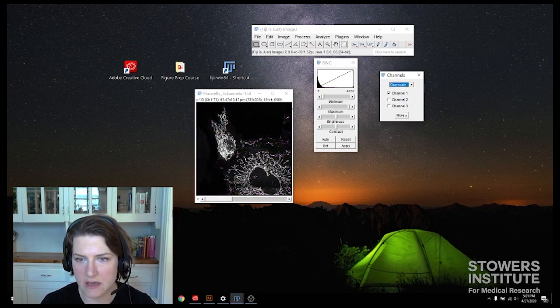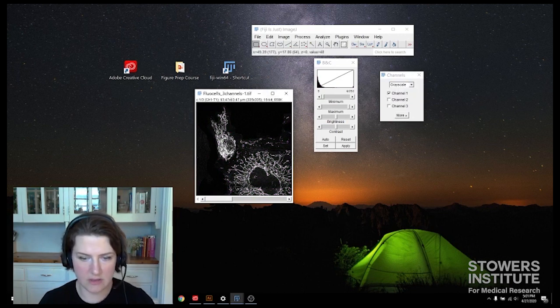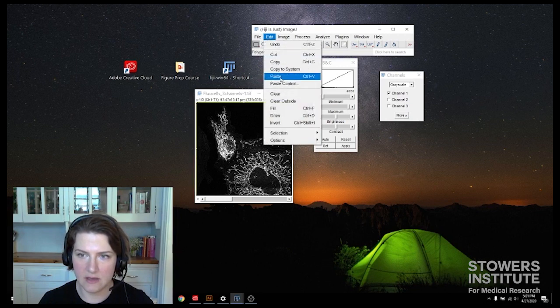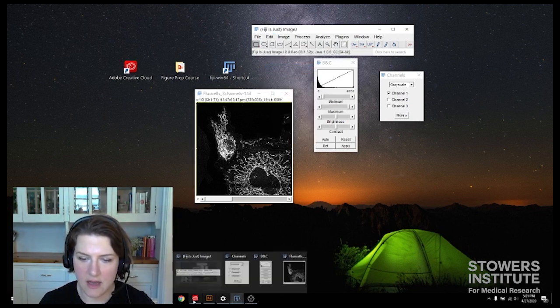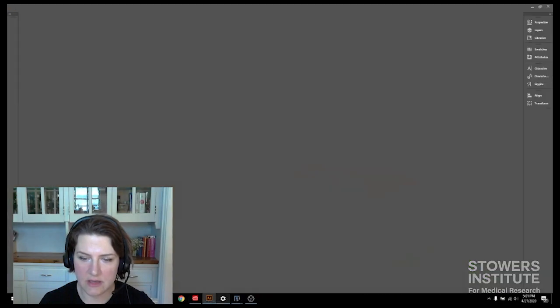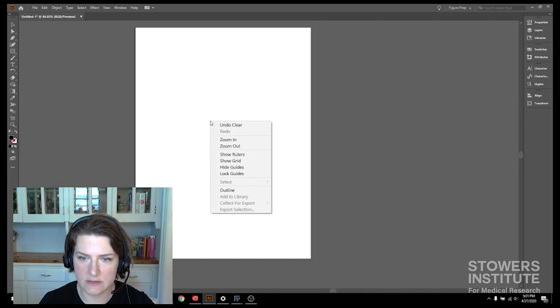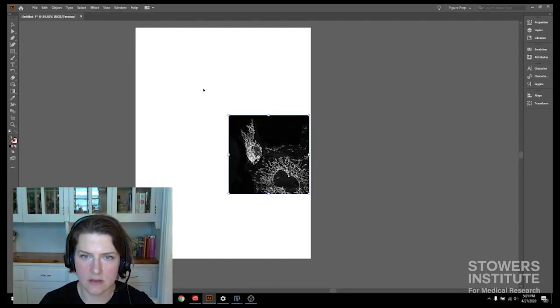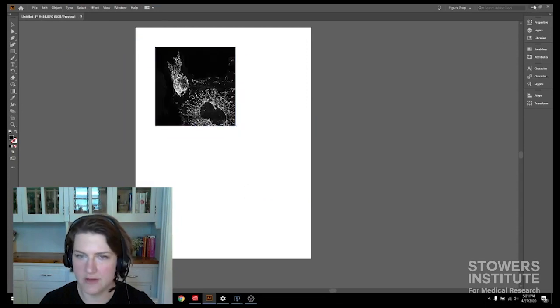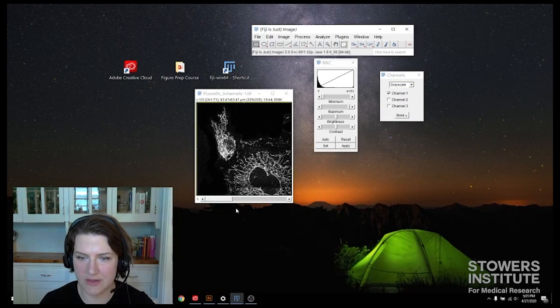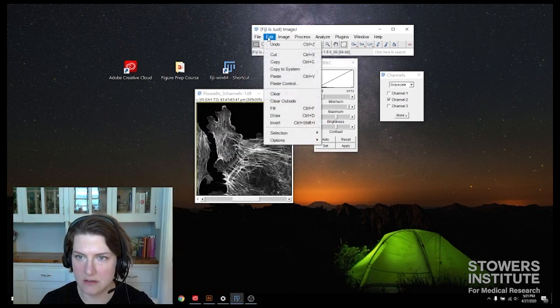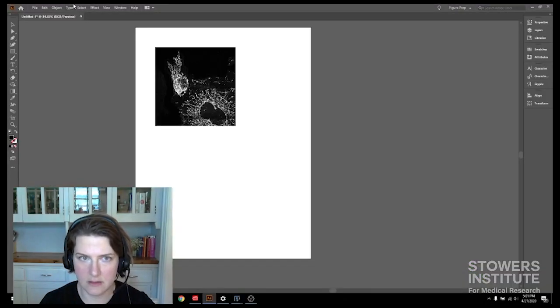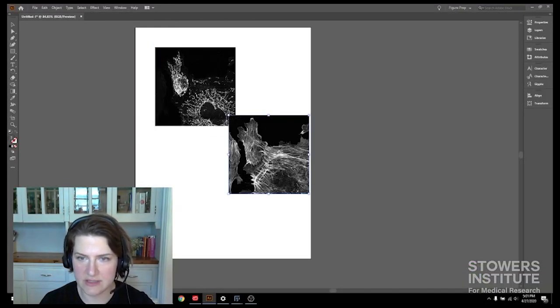And for the first two channels, I'm just going to select all and go under edit, copy to system. And then I can go into my Illustrator. And I can paste. There's my one channel. You can see it comes in pretty large. We'll have to deal with that later. There's my second channel. Put that in. You can also press Ctrl V.